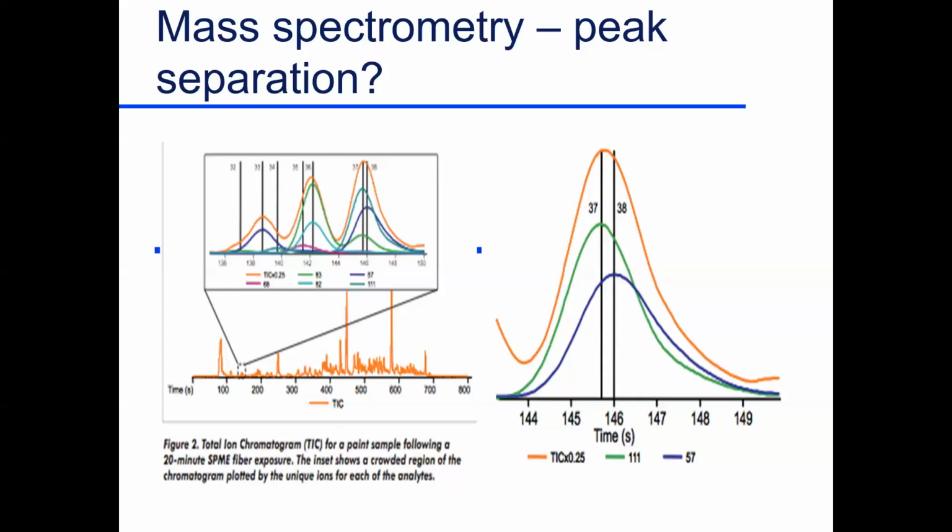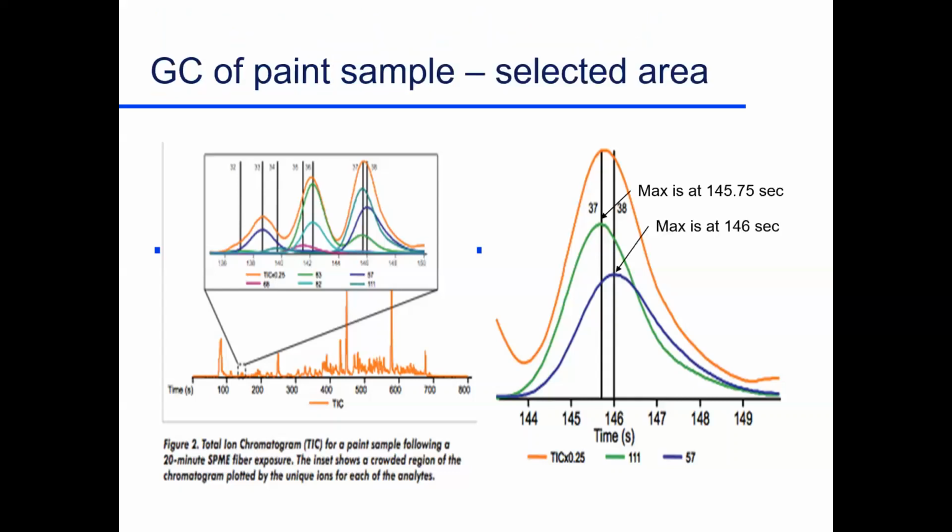And so it's absolutely misleading to think that that's one compound. Maybe you got a good identification there someplace. Well, guess what? It may be. But the neat thing about mass spectrometry as it's evolved is that you can get spectra. You can take these molecules, blow them into pieces, and look at the pieces. You can do that really quickly. So basically that's what you're doing: taking the gas chromatographic effluent, hitting it with really high energy, which explodes the molecules, and then the mass spectrometer measures the pieces.